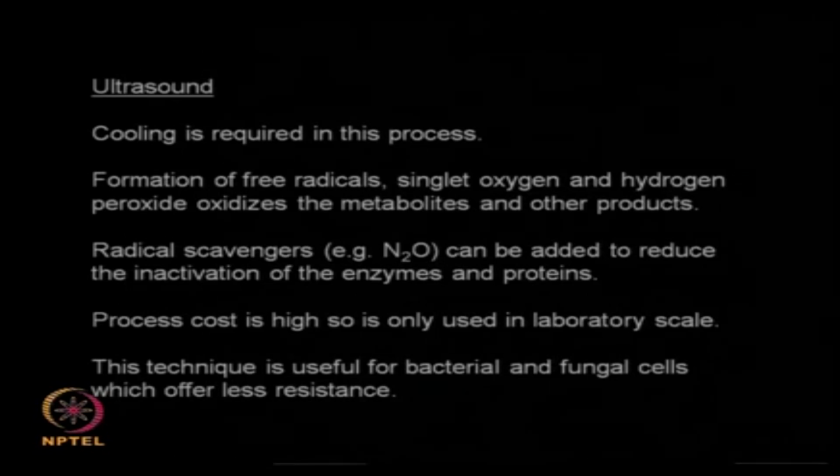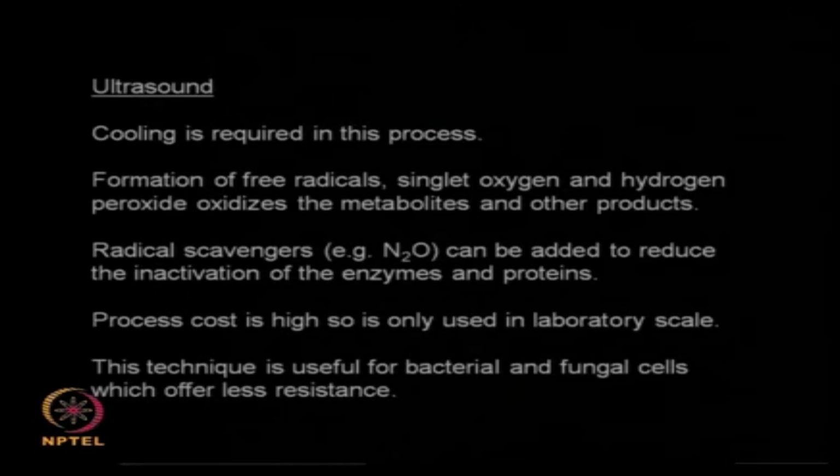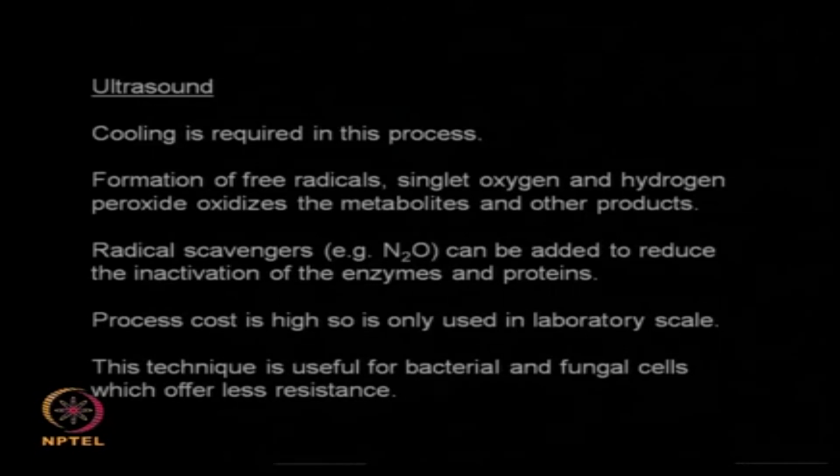Another problem is it can even generate free radicals, singlet oxygens. If you get singlet oxygen, you may be getting hydrogen peroxide, and hydrogen peroxide, as you know, is a very strong oxidizing agent. So it can start oxidizing the metabolites, and you may end up having an oxidation product which is not desired. So you need to be very careful about it, because ultrasound produces radicals.